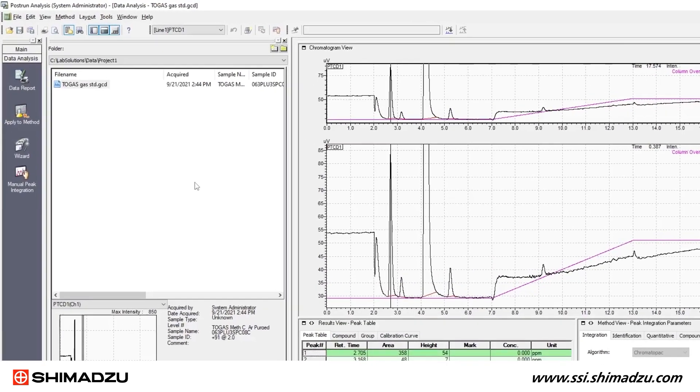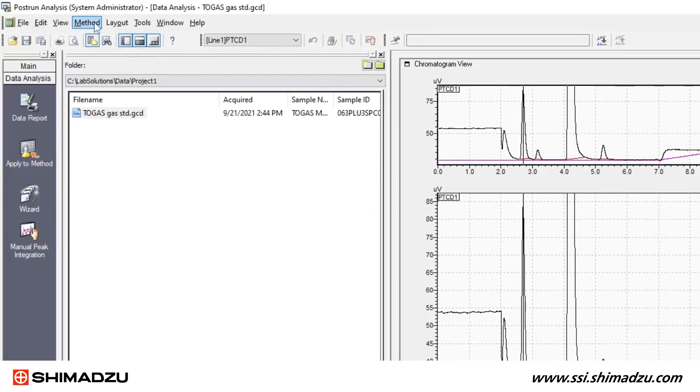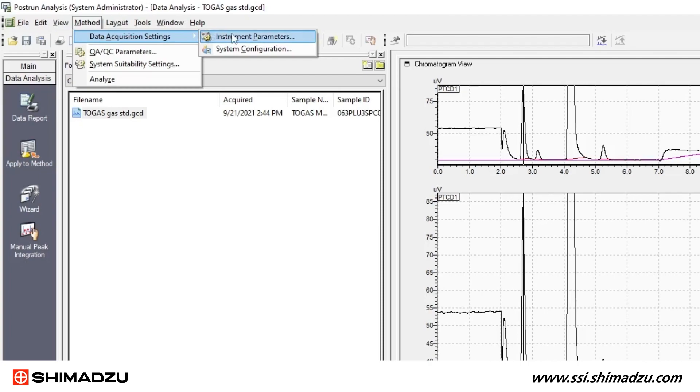Go to the toolbar at the top of your screen. First select Method, then Data Acquisition Settings, then System Configuration.